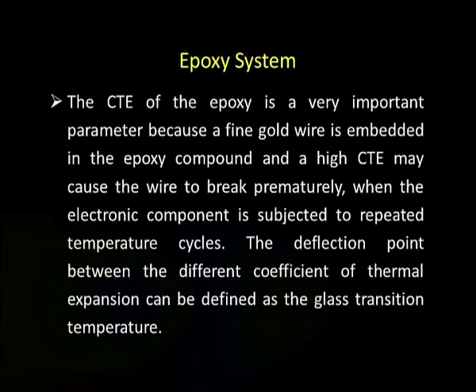The CTE of the epoxy is a very important parameter because a fine gold wire is embedded in the epoxy compound and a high CTE may cause the wire to break prematurely when the electronic component is subjected to repeated temperature cycles.